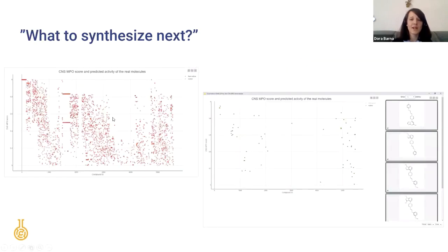And now with this, we are ready to do the final compound selection and triaging. For this, we can continue with using interactive visualization. For example, in this case, we will use an interactive scatter plot view, and some tile views to visualize chemical structures that are behind the points of the scatter plot.